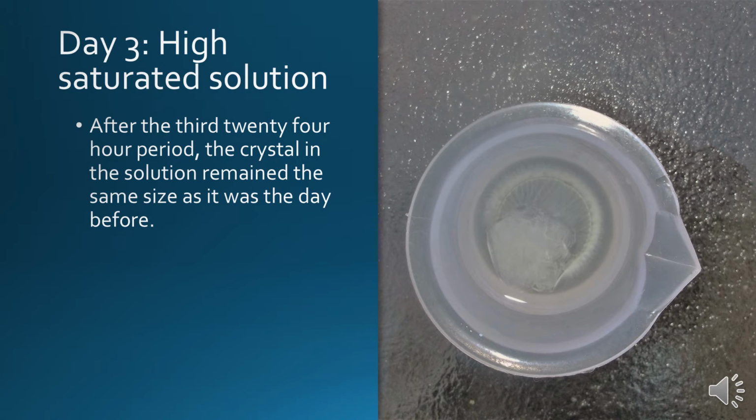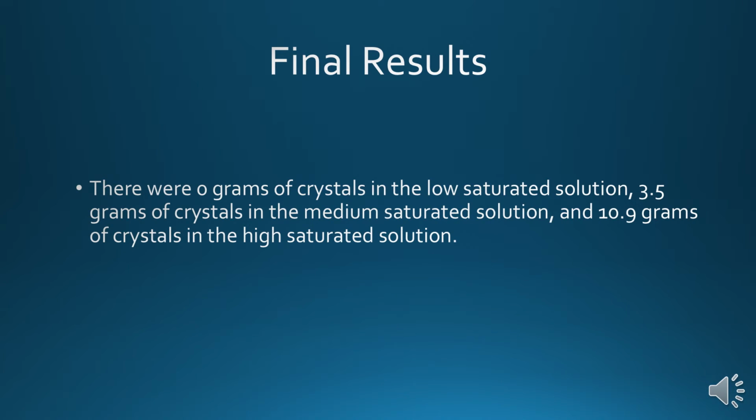Day 3, high saturated solution. After the third 24-hour period, the crystal in the solution remained the same size as it was the day before. Final results. There were 0 grams of crystals in the low saturated solution, 3.5 grams of crystals in the medium saturated solution, and 10.9 grams of crystals in the high saturated solution.